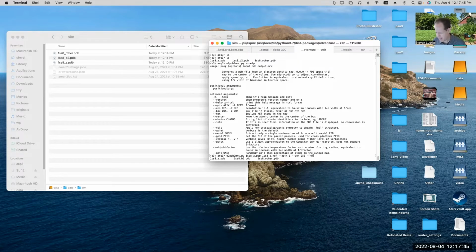In case there are het atom entries, we'll go ahead and use --het. We don't want to use --center because the overall molecule, oh, this may be a problem. We'll have to see how this works. It may be that the center of mass of the SS8 molecule isn't at 0,0,0. Usually isn't in PDB files. So I should have centered it before I did the extraction. Otherwise, we have to sort of translate it so it goes into the right place in space.